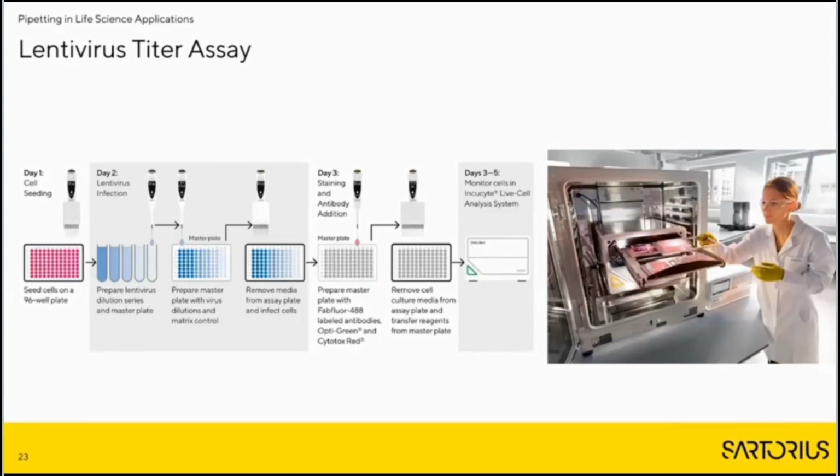So in this example, the modes, the speeds, and the advanced functions on electronic pipettes were added to a lentivirus titer assay protocol to ensure high reproducibility of the assay. The readout of the assay was performed with the live cell analysis system.